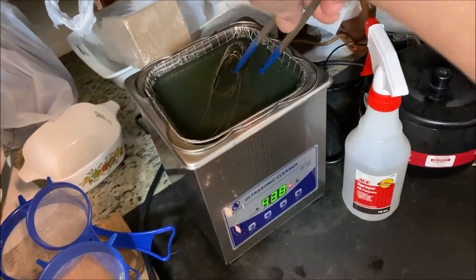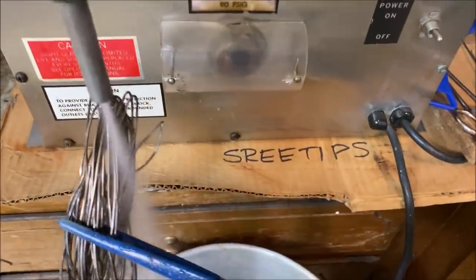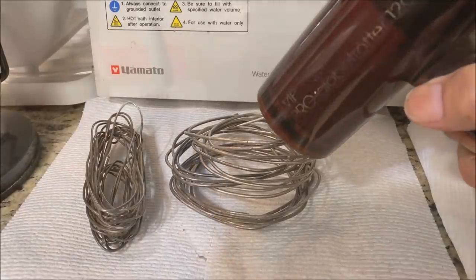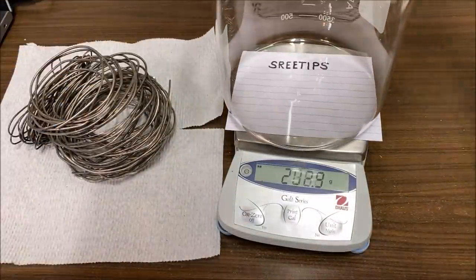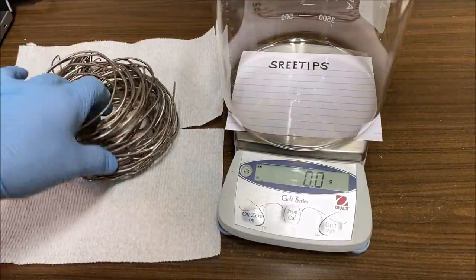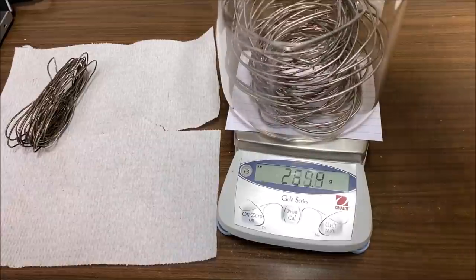I run the material through my ultrasonic cleaner, then rinse it off to get all the soap off, put it underneath the steamer to blow any junk off the wire, then hit it with a hair dryer to evaporate all the moisture. Now the silver's been cleaned and dried. I'm putting a beaker on the scale, taring to zero, and adding the silver wire to get a weight so we can calculate our yield.